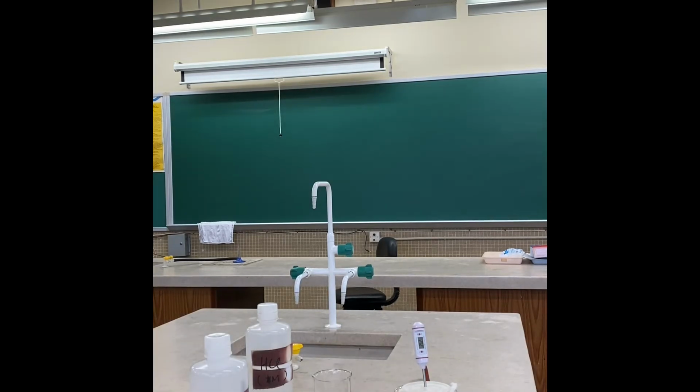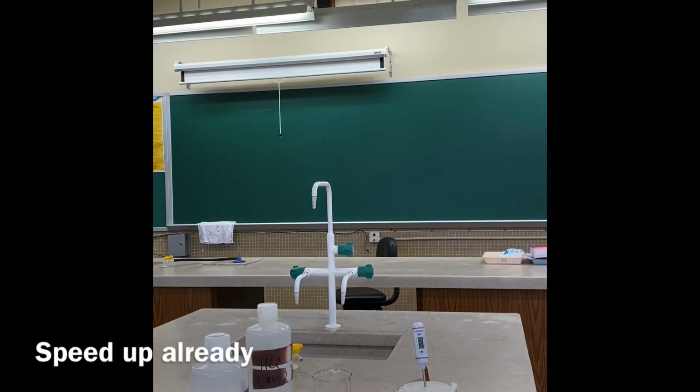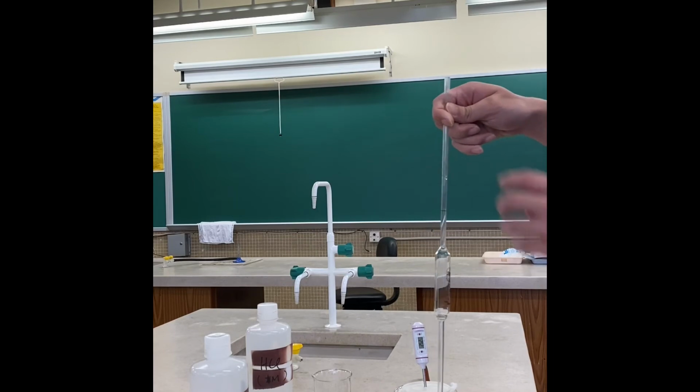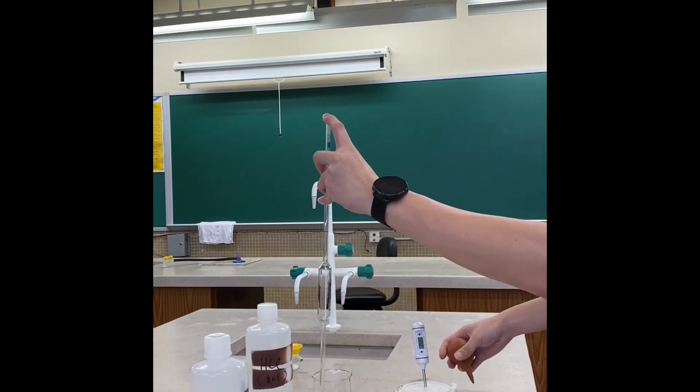You have to take the reading every 30 seconds. It's now still 25.2 degrees Celsius. Until 3 minutes, you have to check. The temperature is still 25.2 degrees Celsius, so you can proceed with the experiment by extracting some of the alkali. We again use a pipette to get 25 ml of the NaOH.